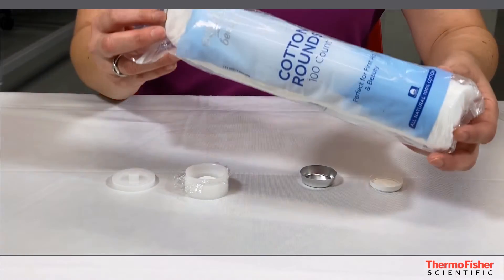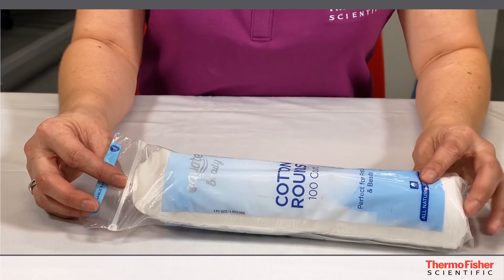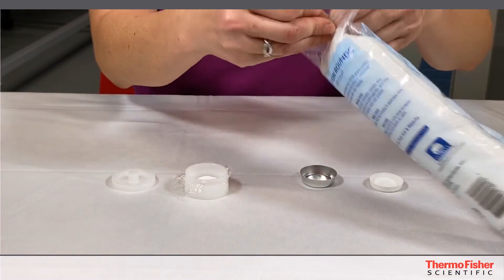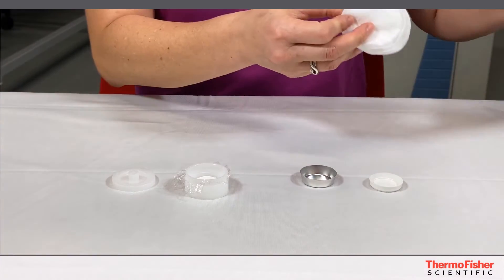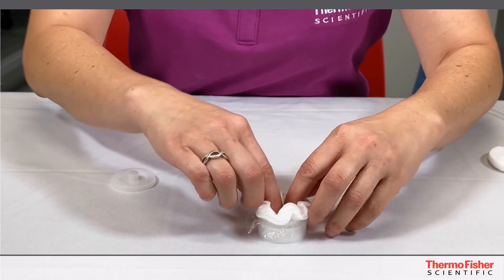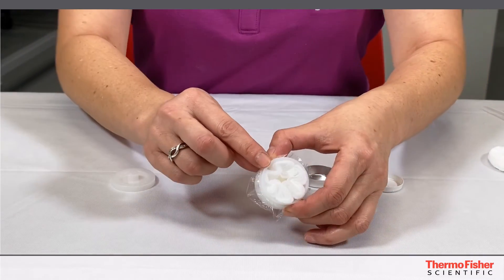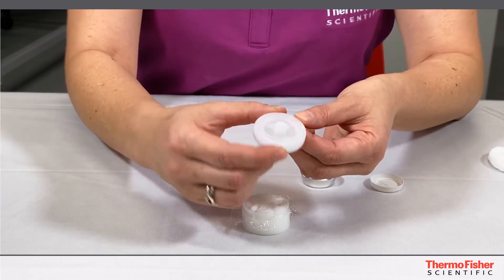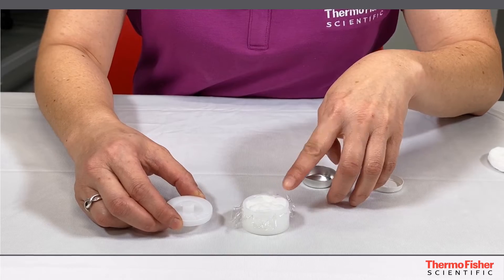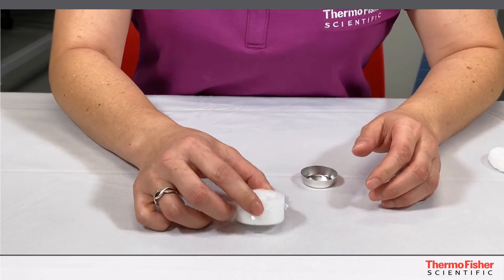Now the trick here is the cotton round. I get these in the makeup section at Walmart or any convenience store. You want to get about two cotton rounds and press them down so that there are no gaps. If you notice in the cap there are two vent holes. The reason we're using the cotton round is that it's breathable so that you can put the sample under vacuum.